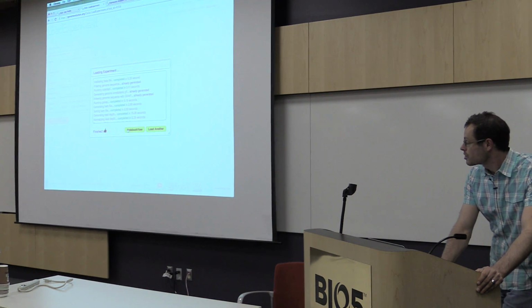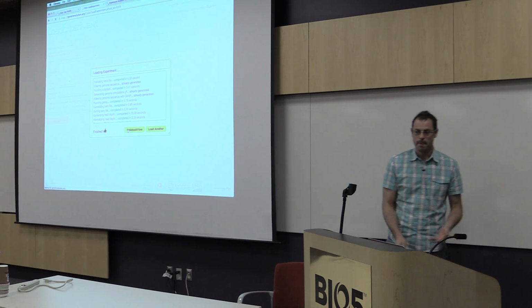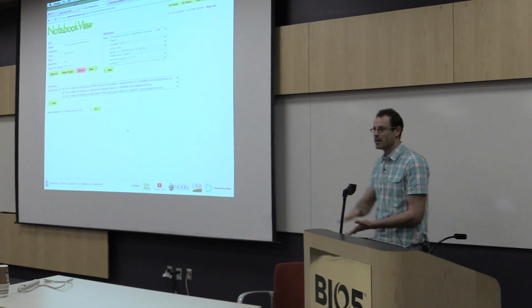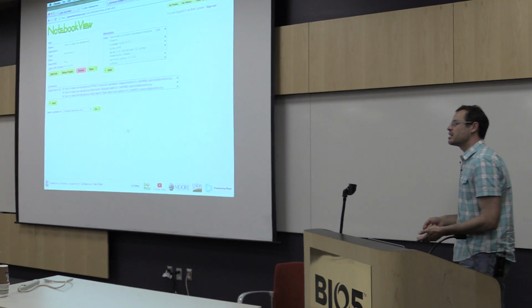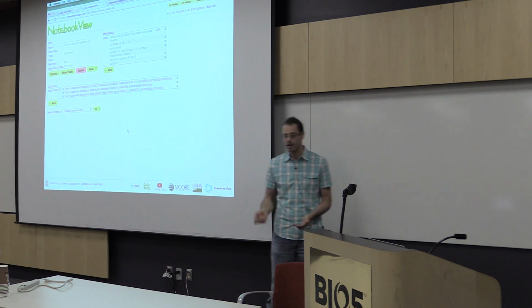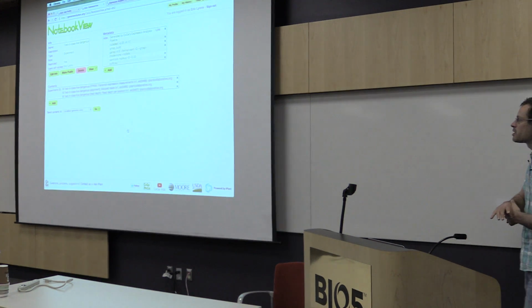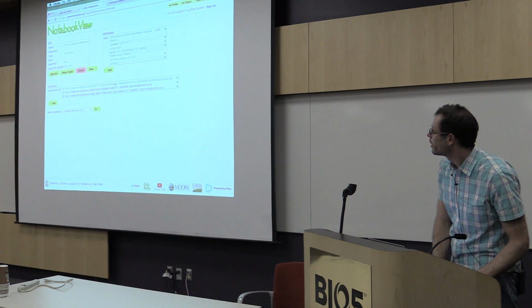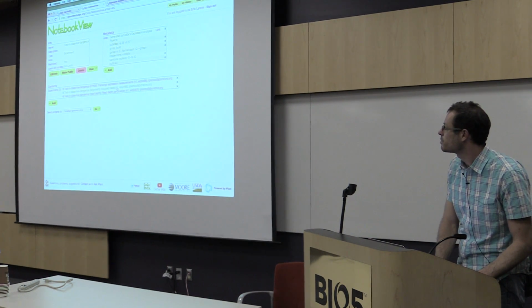So once it's finished, what it has done is it's taken your reads, cleaned them, mapped them to the genome, quantitated it per position along the genome, and then quantitated it per transcript if you have a genome that has been annotated with transcripts. It then takes all of those data sets, loads them and bundles them together inside of the notebook, which you can see right here. So we have 3 data sets. We've got our transcript measurements, our mapped reads, and a read depth per position. This is just a BAM file.